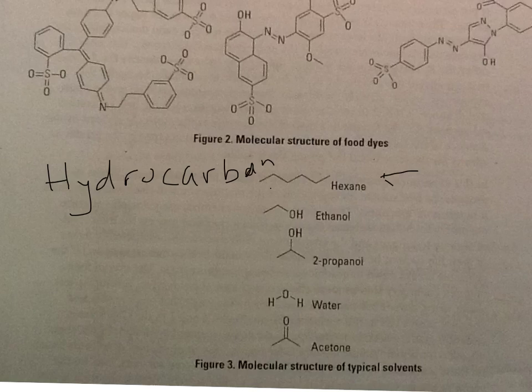It's going to be kind of greasy, and you guys all know what gasoline does when you put gasoline on water, any type of oils, they float. So hexanes right here is not going to be miscible with water, so it's not going to mix with water.